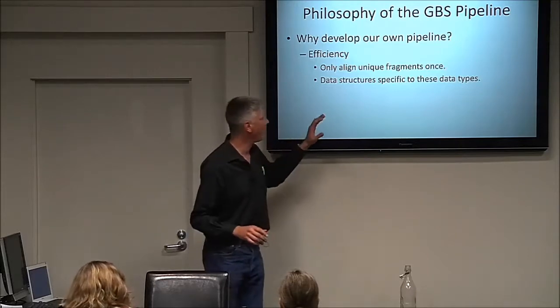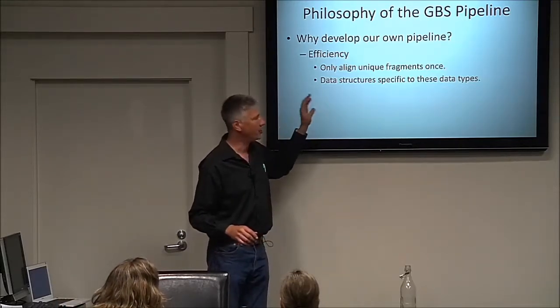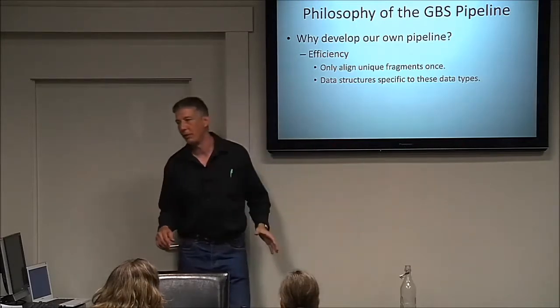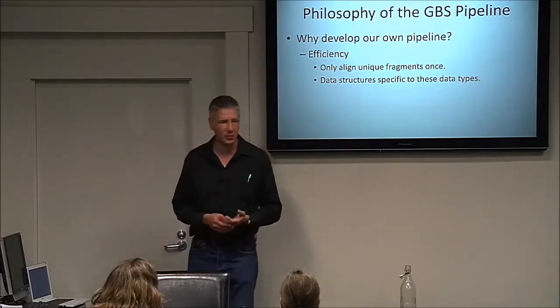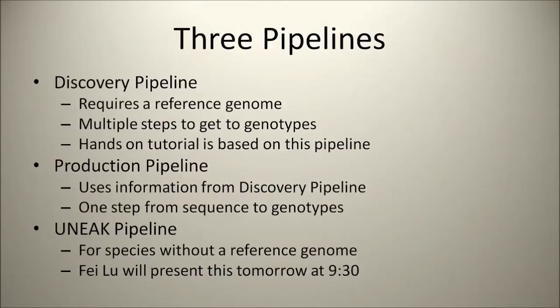So that was one thing we wanted. And then there are data structures that have been created that are specific to the data types that we're working with. In some cases, this was kind of new types of data, and we wanted to be able to work with them appropriately.